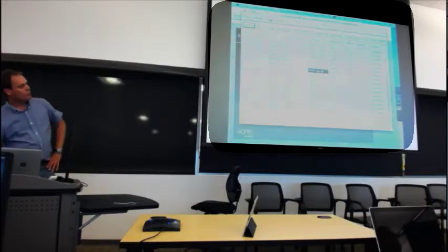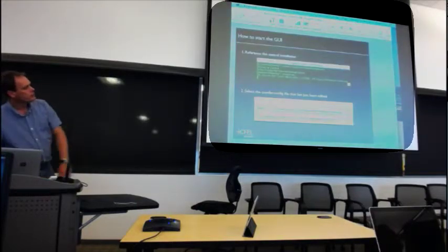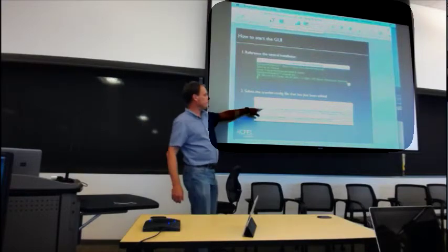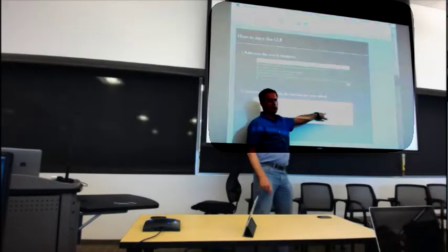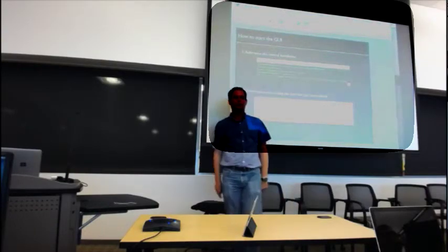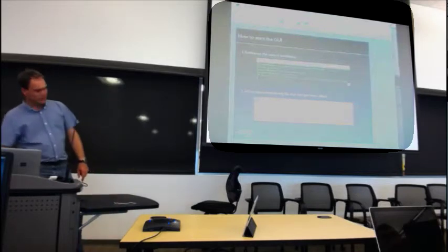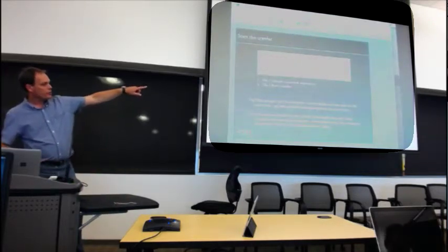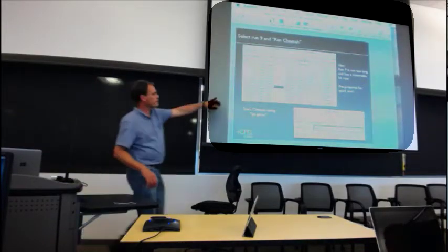Okay. Now, if you want to process something, let me flip back to Keynote here. So we've just gone through this little bit, which hopefully is not too intimidating. And next time you launch the GUI, by the way, that experiment will come up in this dialog box, so you just have one click to go to that experiment, or any of the other experiments. So what's the next thing? Unlock command, we've done this. And you now have something like this.